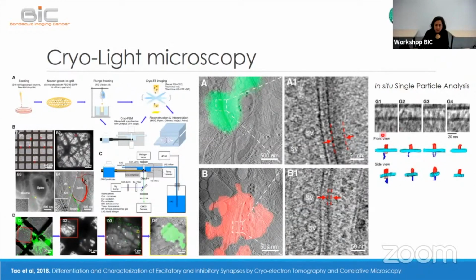It's amazing how they can see it, but they don't have the specific information of these receptors. So that is the perfect way to introduce a little bit what we want to do in the lab. Here you can also see the differences between the resolution of a wide field microscope and the nano resolution of the electron microscopes.